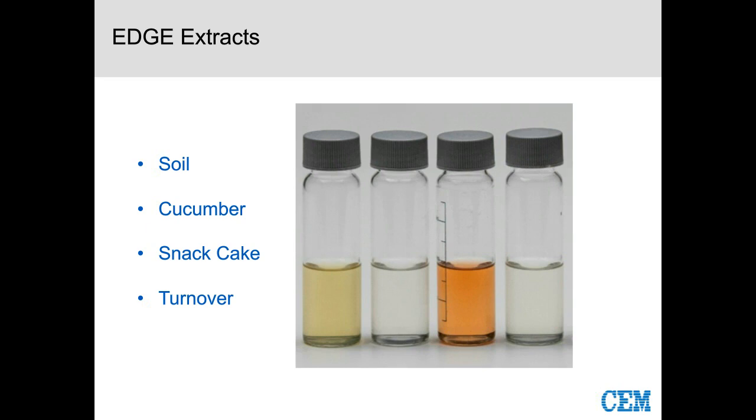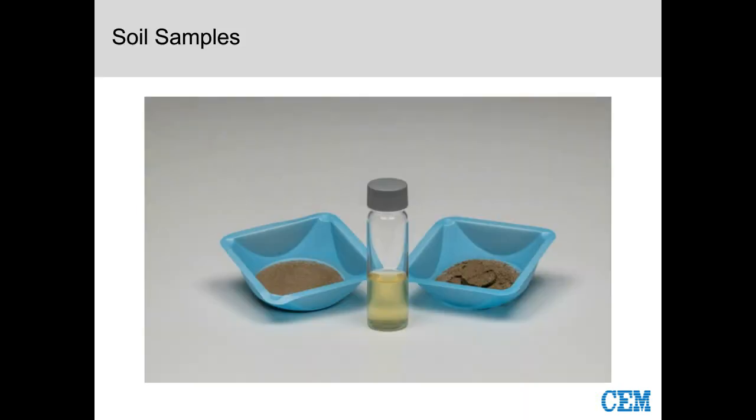So with that, let's talk about the soil sample first. Here's a picture of the soil pre and post extraction and the actual extract that we had. Not too much going on here. Like I said, these samples aren't the most visually appealing as far as the changes that occur, but I like to keep myself honest and show everything. You see a little bit of clumping of the soil because we're draining through that, but it's perfectly dry, and we've got a clear extract ready to go for analysis.